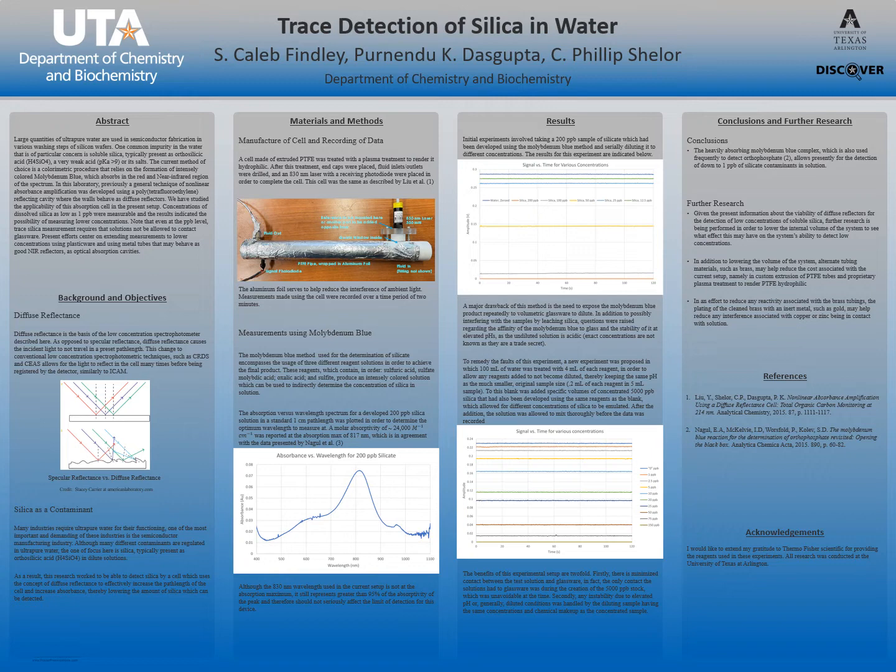You should hopefully be able to see this labeled picture of our cell. Our cell was made out of a custom extruded PTFE, which then underwent plasma treatment to give it a hydrophilic character. You can see our 830 nanometer laser is not in line with our signal photodiode, since this is not a requirement for our setup. This effectively increases our path length, since when light strikes the surface of the PTFE, it'll scatter in many different directions and bounce from wall to wall, wall to wall, and wall to wall until it reaches our signal photodiode.